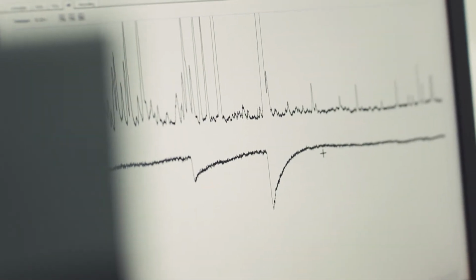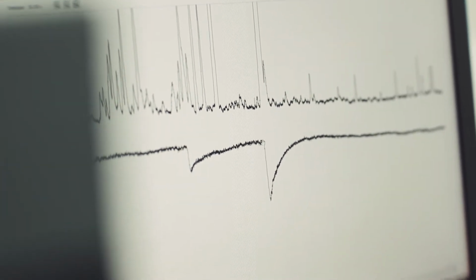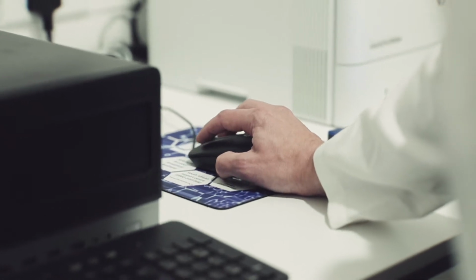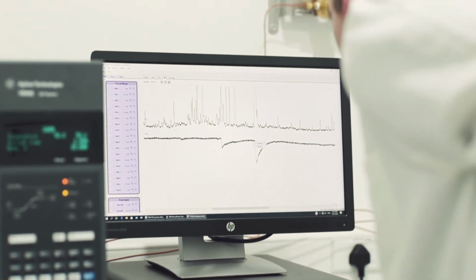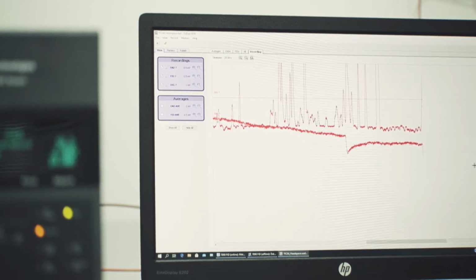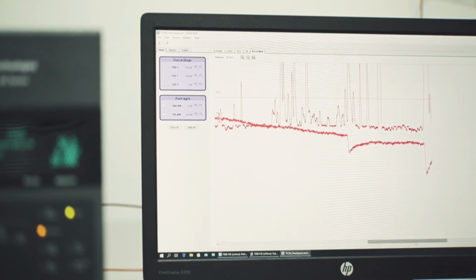And basically what happens is the antenna responds as soon as a compound elutes from the chromatographic column that stimulates the antennae. So these chromatographic peaks that give a response on the antennae are then candidate semiochemicals or pheromones for the insect system. After that procedure, the samples are then taken for identification of the pheromone compound.